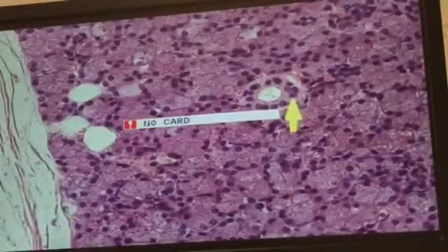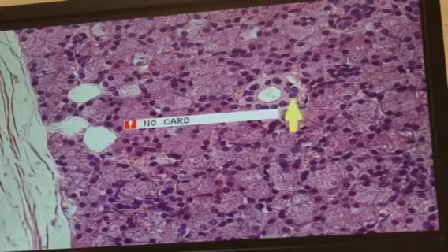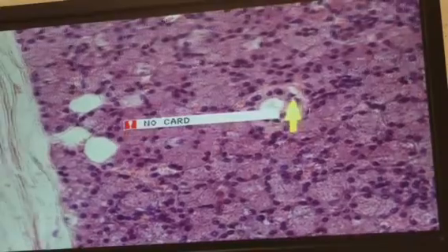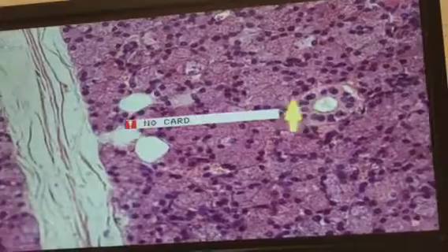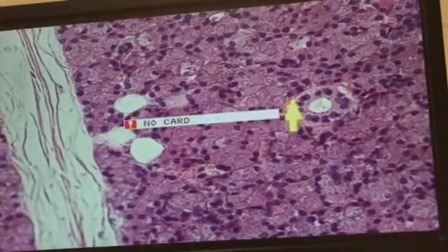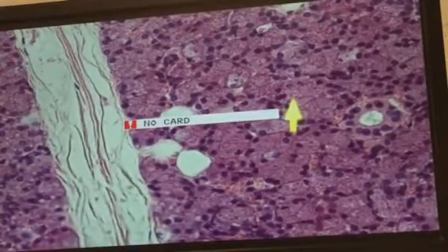And even though we can't see the basal striations quite as well, it's the same size or perhaps larger than the surrounding acini. You can barely make out some of the basal striations, and we see some capillaries in the area right there. But we can also see the secretory granules in the cytoplasm of those acinar cells.